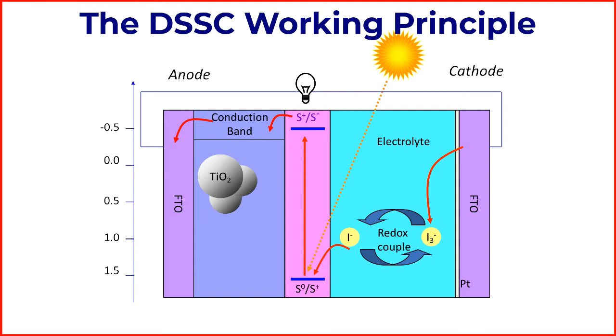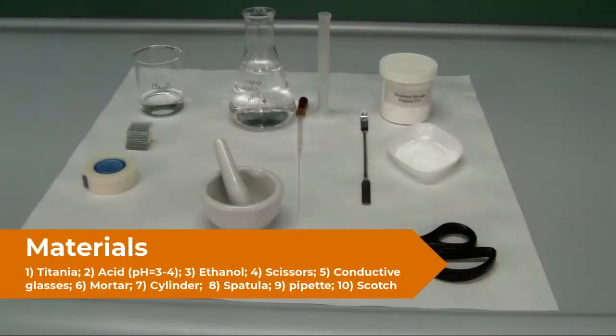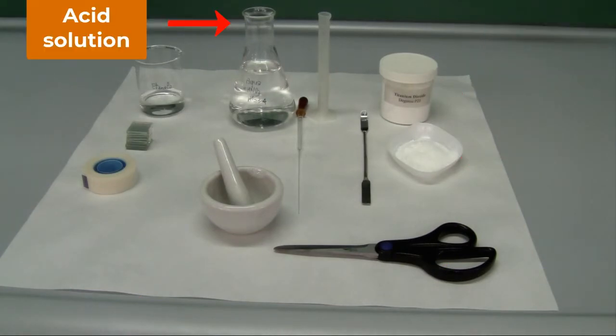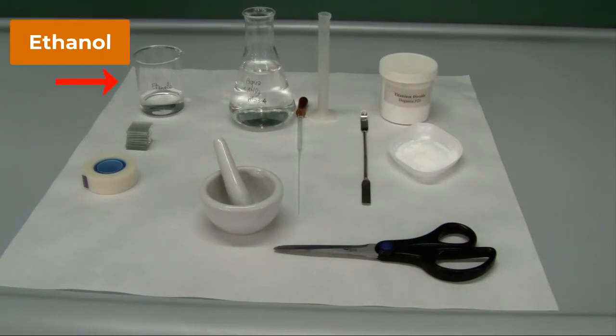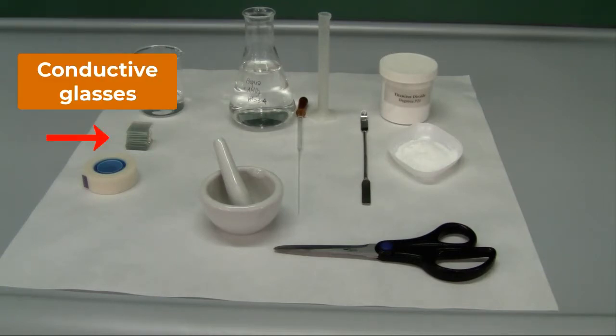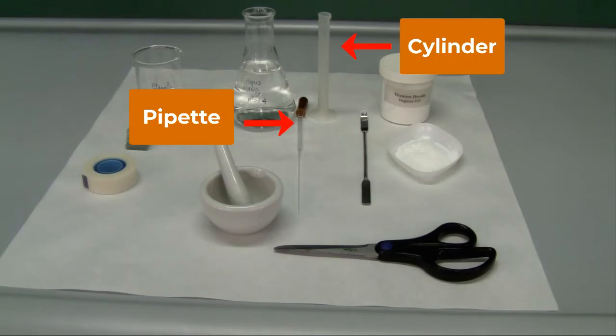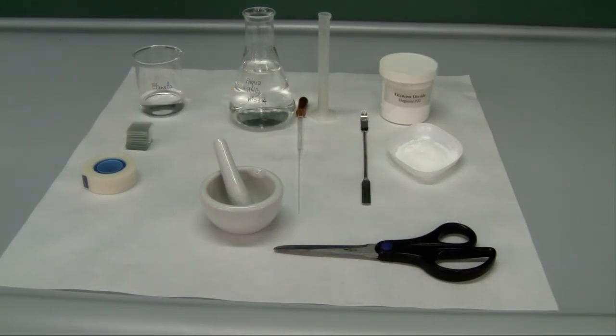Let's now see how we can produce manually our dye-sensitized solar cells. First of all, we can see here all the materials we need. Titania powder, an acid solution at pH 3-4, ethanol, glasses, conductive glasses, a removable tape, a mortar, scissors, a spatula, a Pasteur pipette, and a cylinder. We will have to prepare a titania paste with the titania and the aqueous solution of an acid that can be deposited on the glasses, which will be deposited onto the bench.